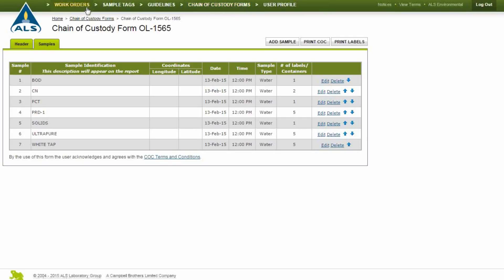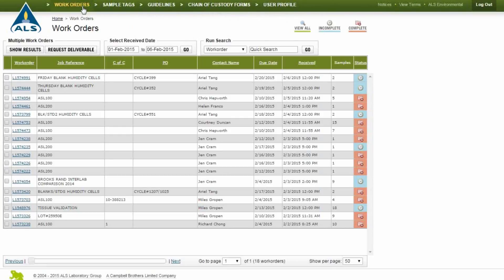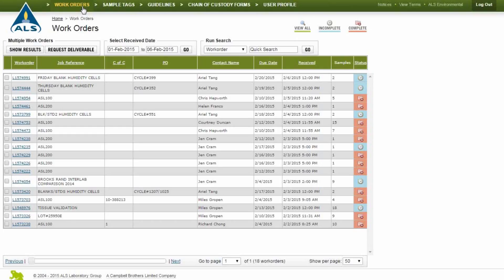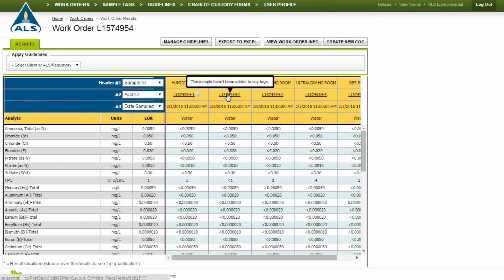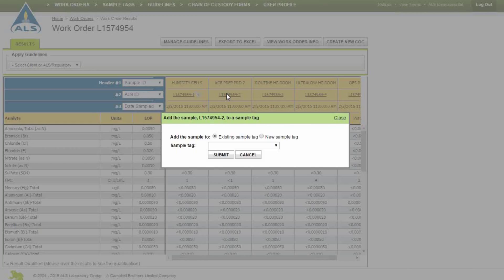Samples can be grouped together using sample tags. This function allows you to graph the results historically for trending purposes. To add a sample tag, open an individual or multiple work orders so the results are visible on the screen. Mouse over the ALS ID you wish to tag and click on it. Choose an existing sample tag or select New Sample Tag and enter a new name.